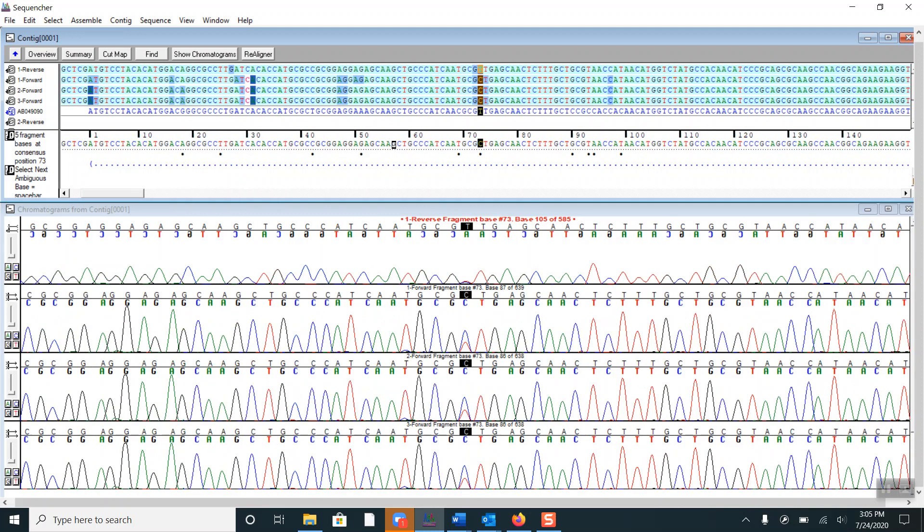If I move over to this base disagreement here, we can see that three of the fragments clearly have both a C and a T peak.